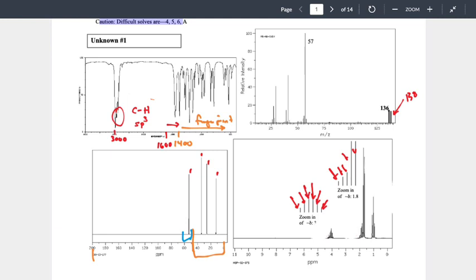Why is that important for us? If we go back and look at our diagram here, what happens with this first one? It goes up and then it comes down. That is one signal that has split into multiple pieces. How about the very first one?